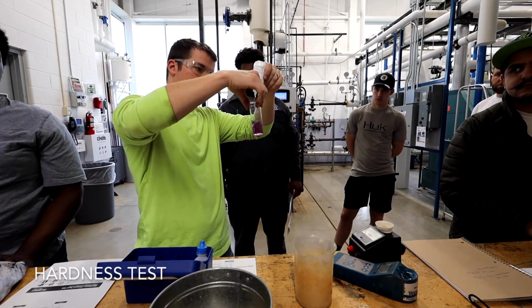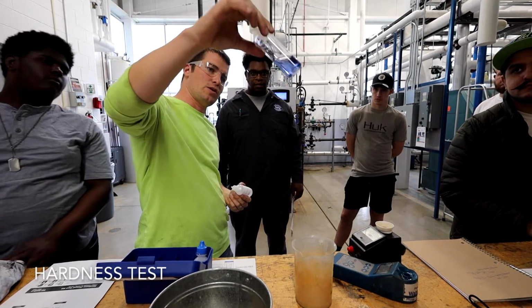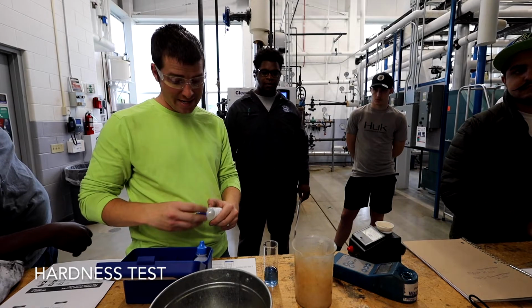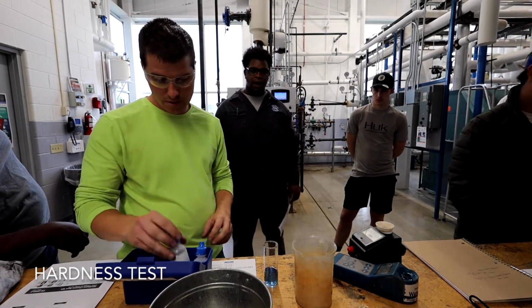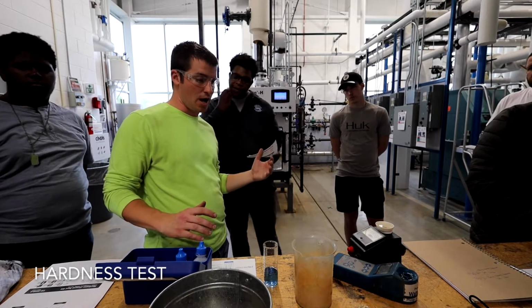6, 7, 8, 9. Purple. All right, blue. So 9 drops. So then 9 times 0.5. 4.5. 4.5, right. So 4.5 parts per million of hardness.